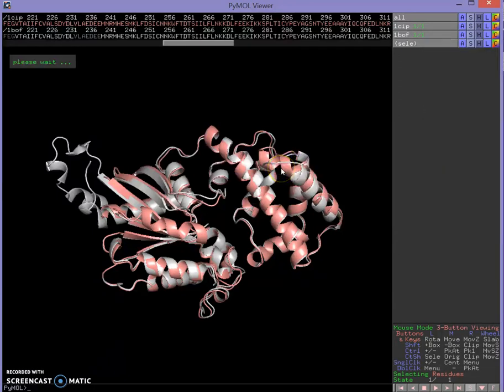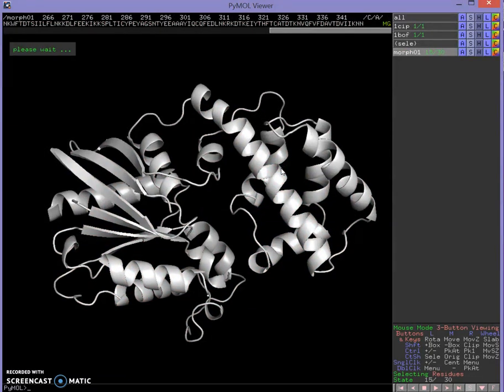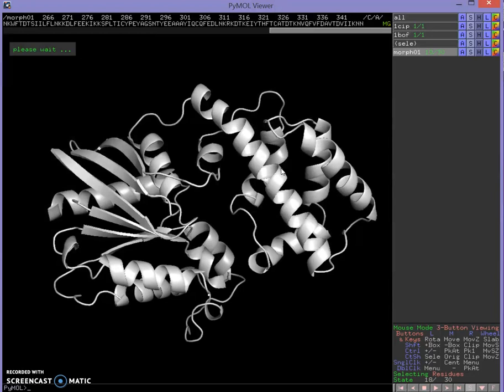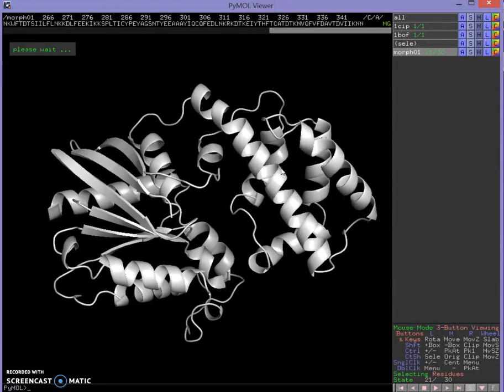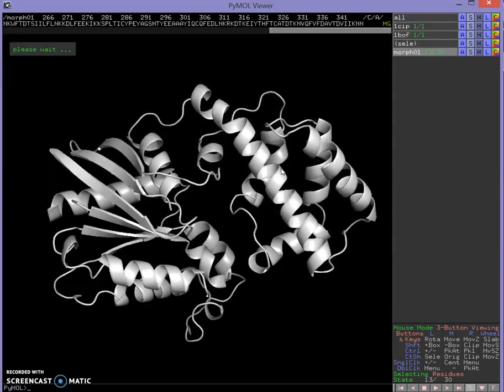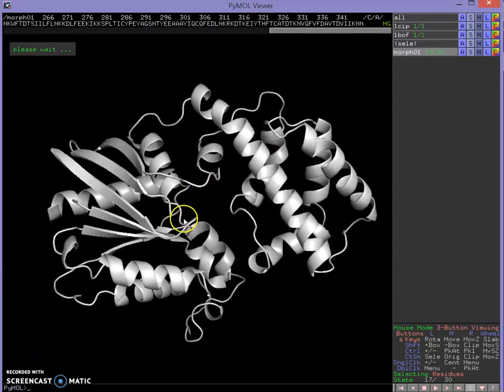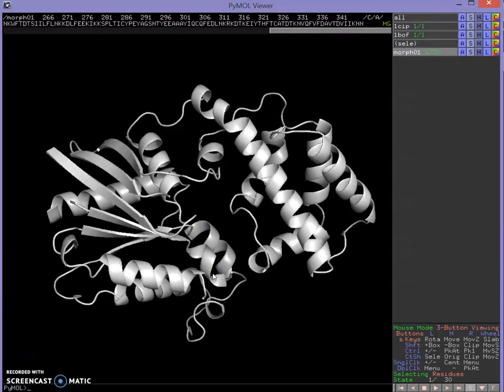This is going to go through some calculations that come up with a hybrid showing essentially the trajectories of different side chains in this protein connecting between the GDP and GTP-bound forms. You can see some pretty decent-size movements — the two lobes are moving towards each other, some loops are moving, this helix is elongating, and some loops are moving in the active site. A lot of this movement is crucial for the activity of G alpha.